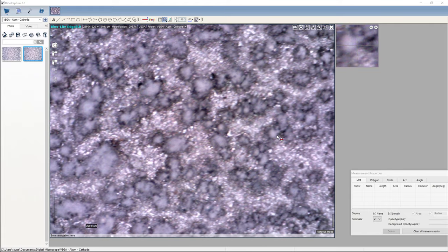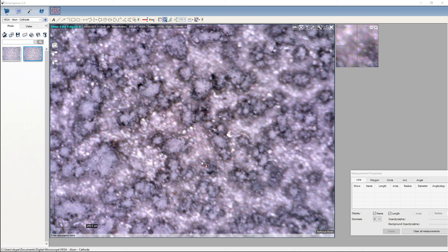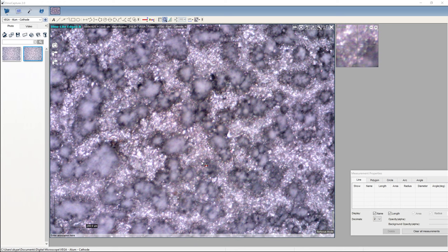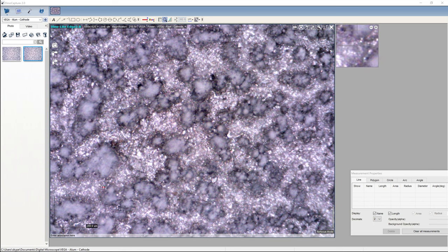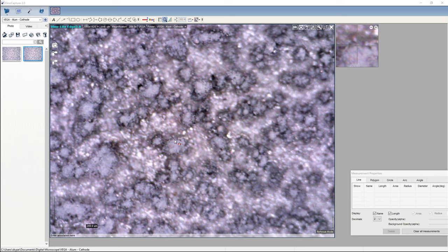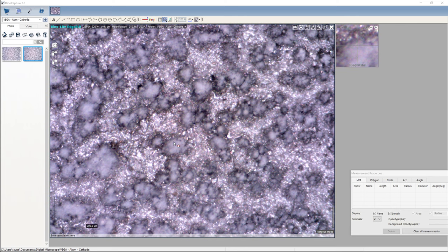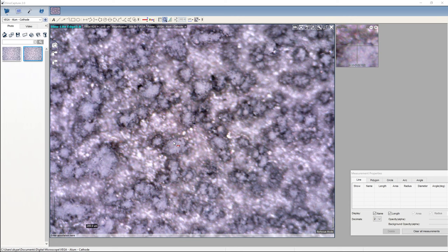What do we have? Okay. So I think this is a growth on the surface. So actually the original aluminium here are channels. And these are most likely aluminium oxide. Most likely. But maybe not. Maybe they are silicon or something else. To be determined. Anyway, I'm going to take a couple of images of these. Stacked images.